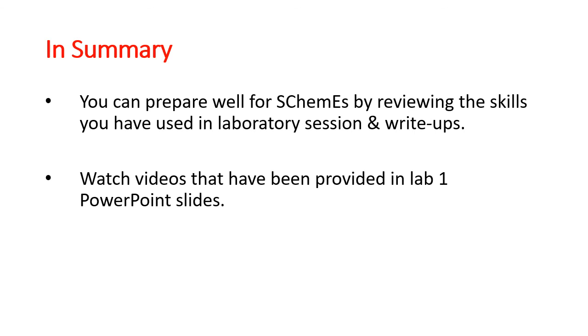Watch the videos that were provided in Lab 1. They will help you a lot while handling the separating funnel, the vacuum filtration, how you use it, how to separate, how to shake, how to vent, how to keep the separating funnel standing, and the other glassware manipulation. So you will have demos and videos in Lab 1 that will help you a lot in this.